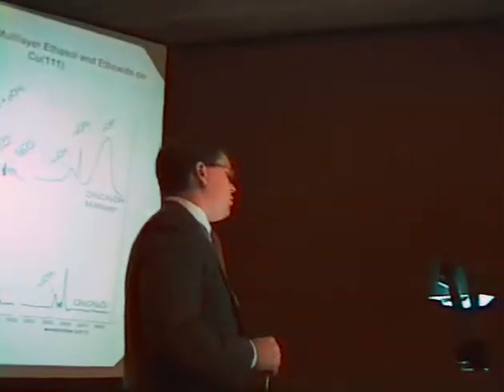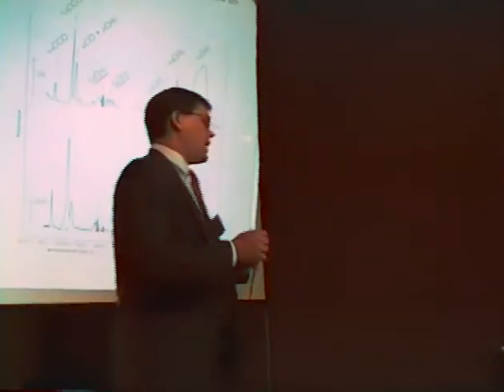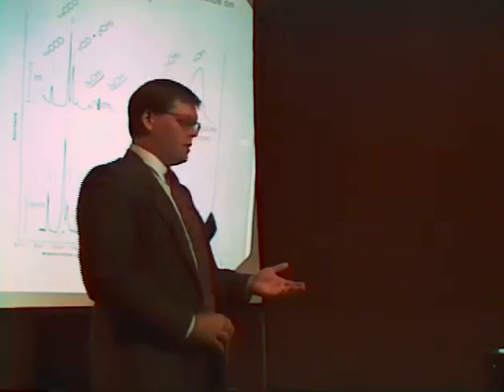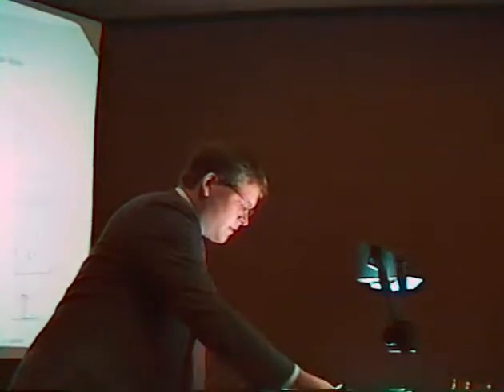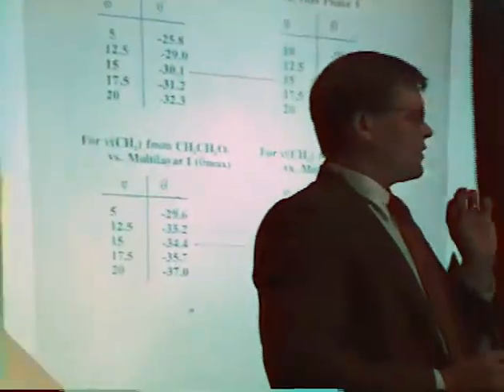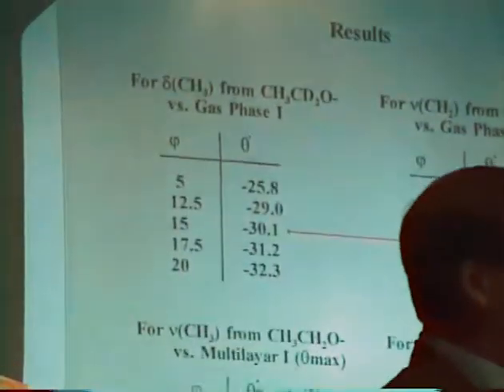Right. So you could do an error analysis where you assume that it had that intensity up to your limit of detection. In fact, I did that kind of analysis in a way. When I did the analysis, I used, in one case, data from CH3CH2 ethoxide, where we know that the region of the symmetric methyl group stretch also has in it the asymmetric methylene group stretch.